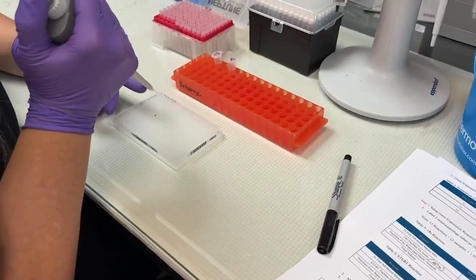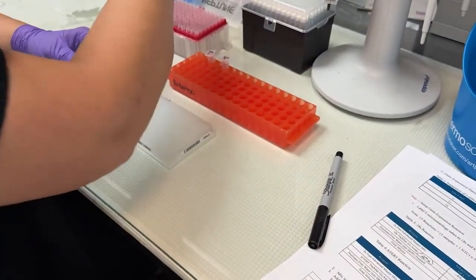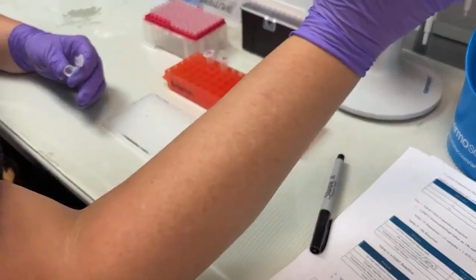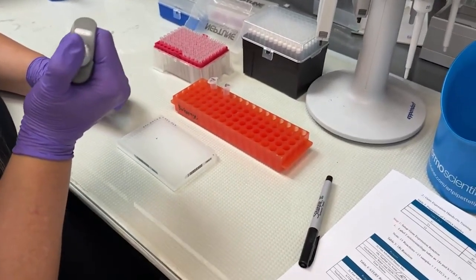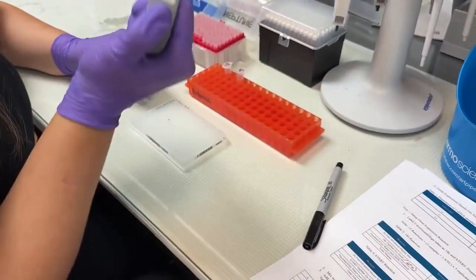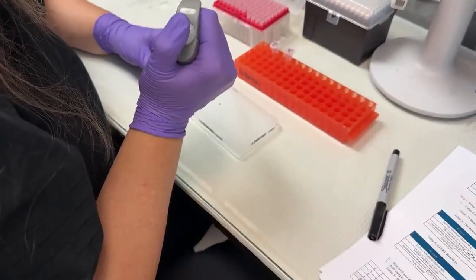So I'm adding 2 microliters of sample to each reaction. Why 2 microliters? Well, I already know what the appropriate concentration should be. Why 2 and not 1? Well, that's an excellent question. Let's talk about it. 2 microliters is more accurate to pipette than 1 microliter.